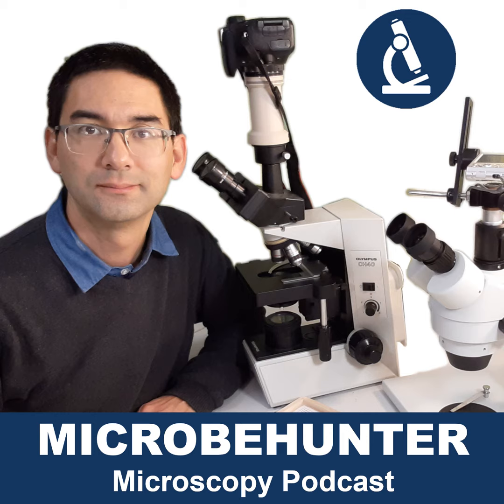Hi, my name is Oliver Kim, and in this episode I'd like to talk about the different microscope types that there are. When people go to a microscope shop and want to buy a new microscope, the first question they're often asked is, well, what do you want to look at? What are the things that you want to observe?